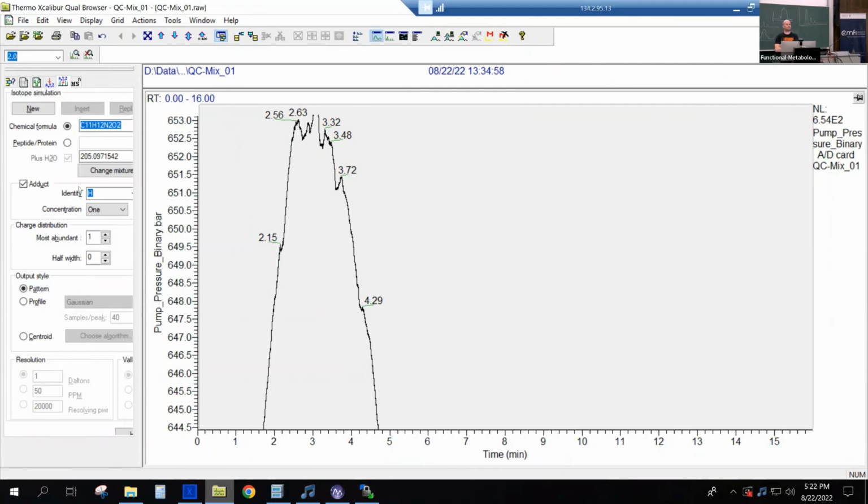That's what we do in order to have both pumps running. I guess, yeah. Okay, so 95 is better than 99. Like 5% acetonitrile in A and 95 in B. I like to switch them. Or I don't know. Interesting. And they have a Vanquish too? I'm going to look up the chat. Maybe I'll write her offline.